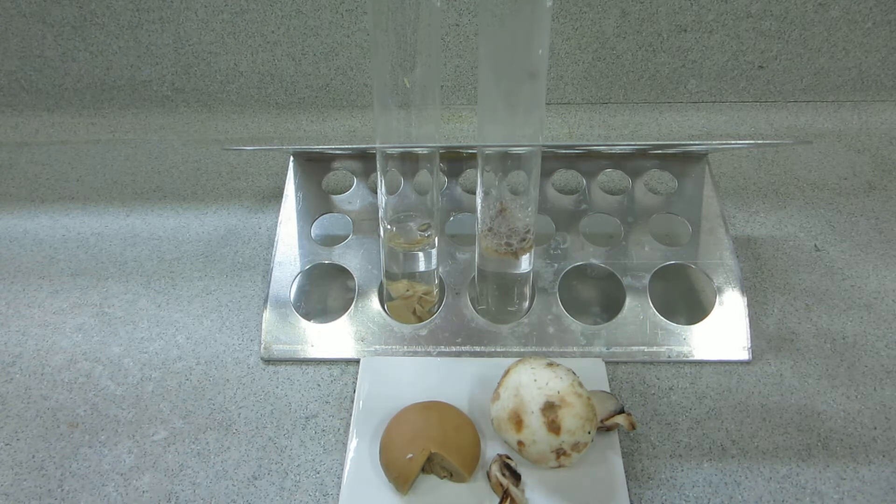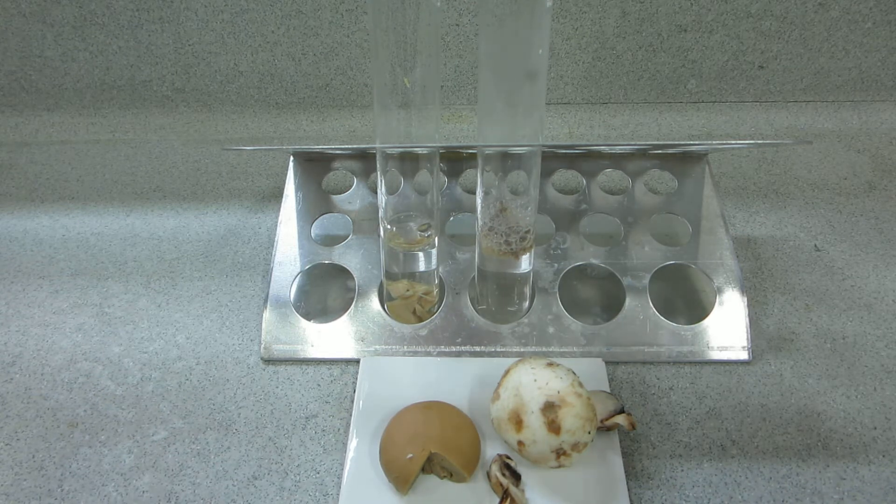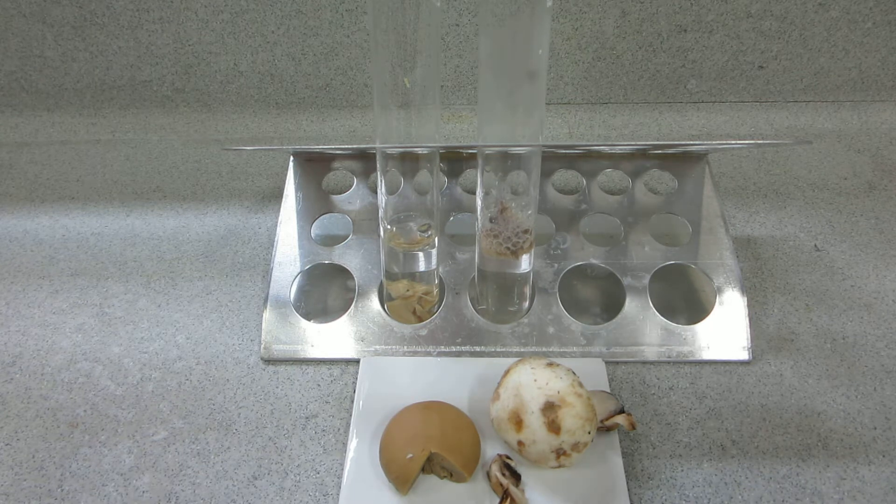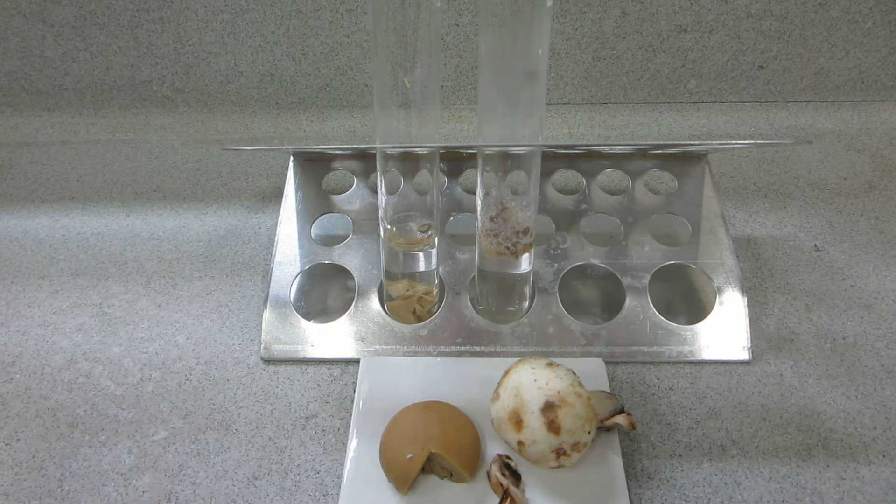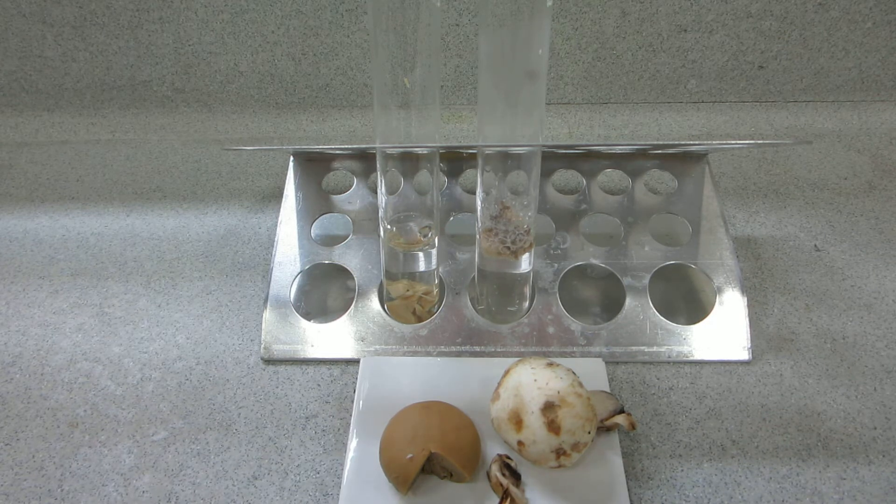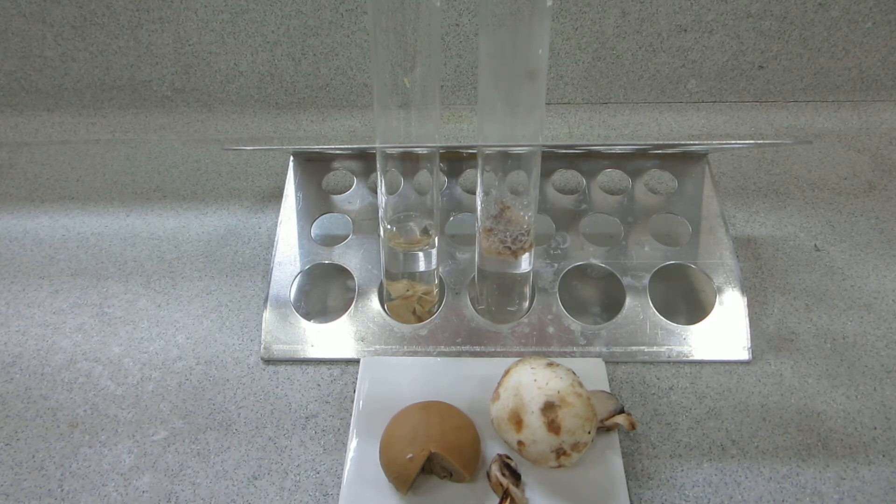So that's quite an interesting example of destruction of an enzyme during the canning in the mushroom, presumably a catalase which catalyzes the decomposition of hydrogen peroxide producing oxygen quite rapidly with the live mushroom.